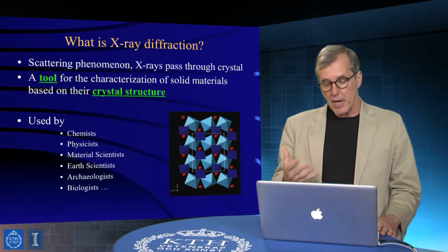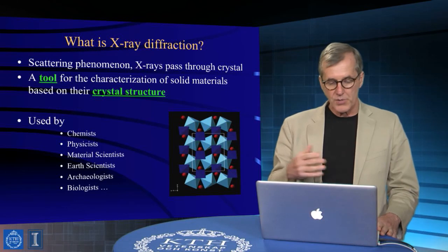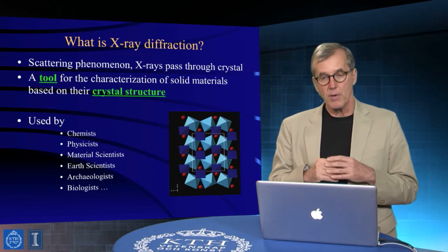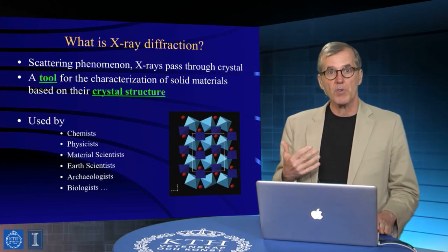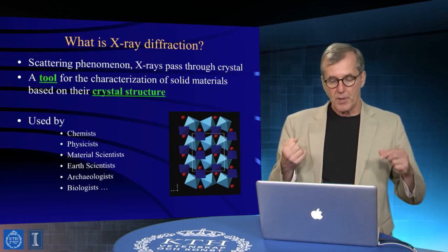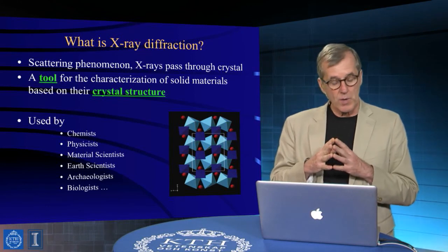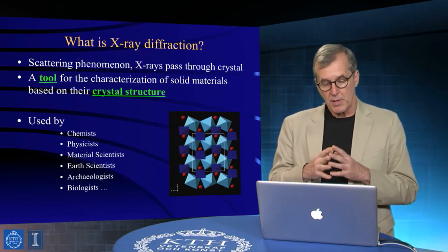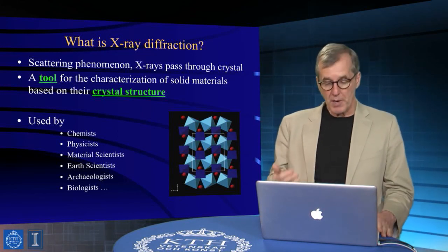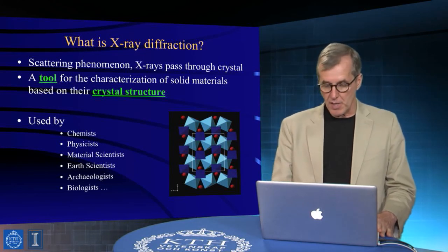And this is the kind of information that's used intensively by chemists, physicists, material scientists, earth scientists, basically, if you care about the structure of something, and for cases where that structure has long-ranged periodicities associated with it. In point of fact, X-ray diffraction is one of the best techniques, and sometimes the only technique that can be used to deduce information about how atomic arrangements exist within a solid material.